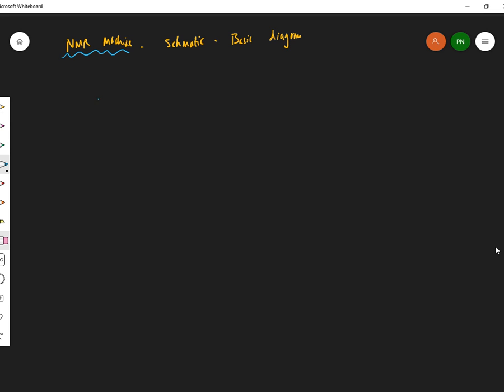Okay, so you have something that provides, this box provides the frequency. In other words, it generates a frequency. And the frequency, believe it or not, is in the radio waves, the radio wave part of the spectrum.